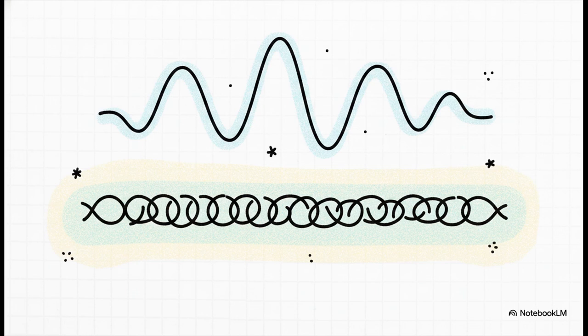On the flip side, if we see broad peaks, it means the interactions are smeared out. Broad peaks typically point to histone modifications, like H3K4me3 or H3K27me3. Since histones are the spools that DNA winds around, modifications to them tend to spread across much larger domains, sometimes covering entire gene bodies. It's a wider structural change, not just a tiny precise switch.